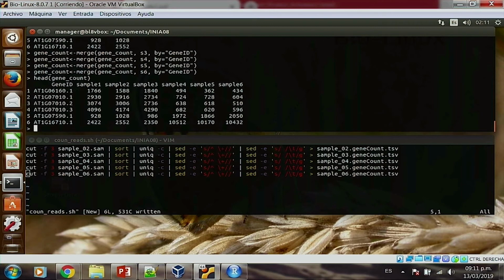For statistical purposes. So now, if we wanted to save this table as a file, we would use a very weird command in R called write.table. Write table is what we'll use to write this table down. How do we use it? Simple. The first argument is what table we want to save. Then the name of the file we want to save it in, genecounts.csv. What kind of separator do we want in the text file? We want to use tabulation, tab.